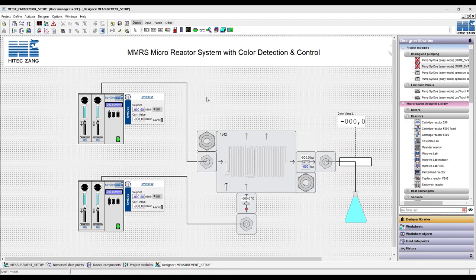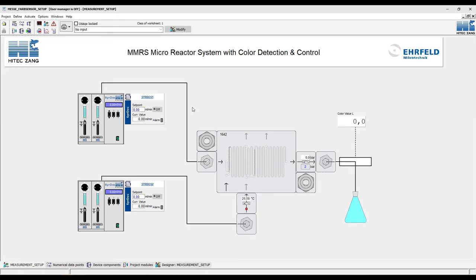Now we can switch back to our user interface. As you can see, we can set the flow rates and turn on and off both pumps. We see the current flow rates and get an alarm if we have problems with the communication. We have the temperature and pressure sensors, as well as the sensor for the color values, which gives us already a full control of our reactor setup.